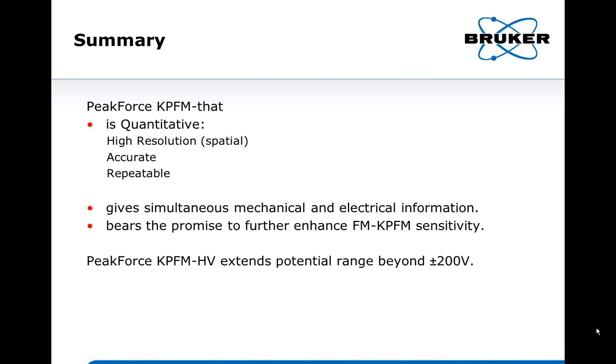The next question: that improvement in the repeatability, is that sample dependent? No, actually, for the repeatability data you saw in the presentation, we did it in ambient condition.